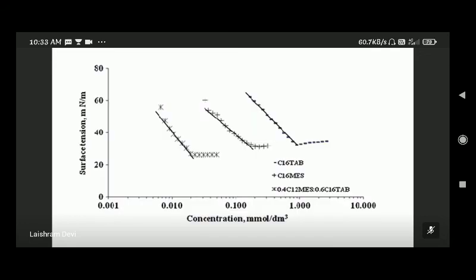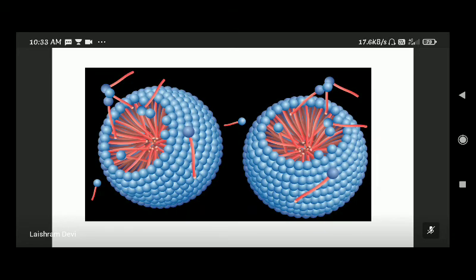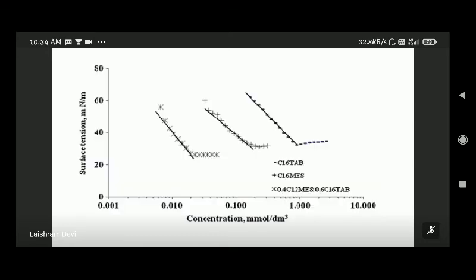So how you're going to actually perform the experiment: it is similar to what you did in the last class. In the last class I explained the procedure: an unknown solution is given to you, any unknown solution, and you determine its surface tension. Here you will be given different concentrations of detergent solution. Starting from a very dilute solution of detergent.